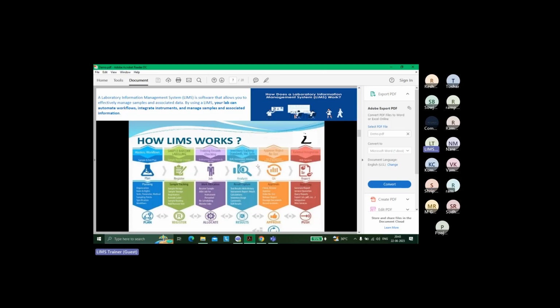Basically, maybe those who don't work with workflows, maybe they are in an IT company working on some master data project, creating master data directly. There are some projects where others create the workflows for you. The developers themselves create the workflows, right? They use HTML, CSS, all the coding technology and whatever is needed to create the workflow. Because whatever you click in the workflow, it's there already in the drop down menu for LIMS, right?